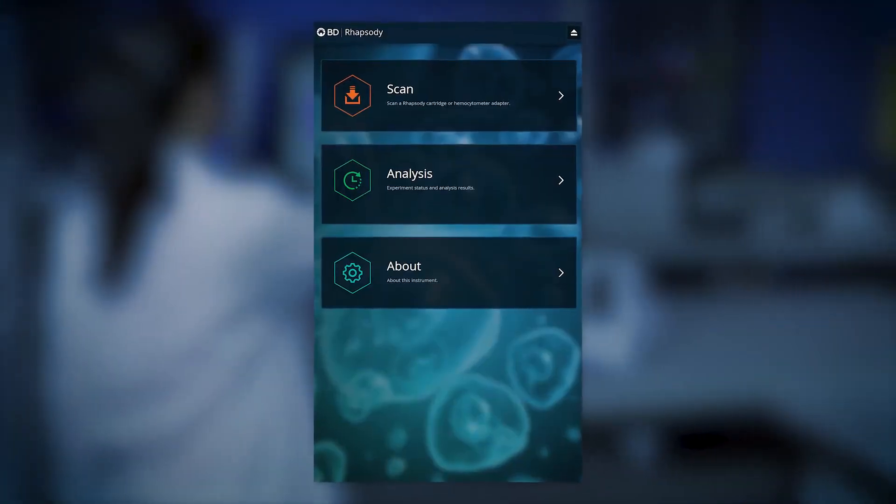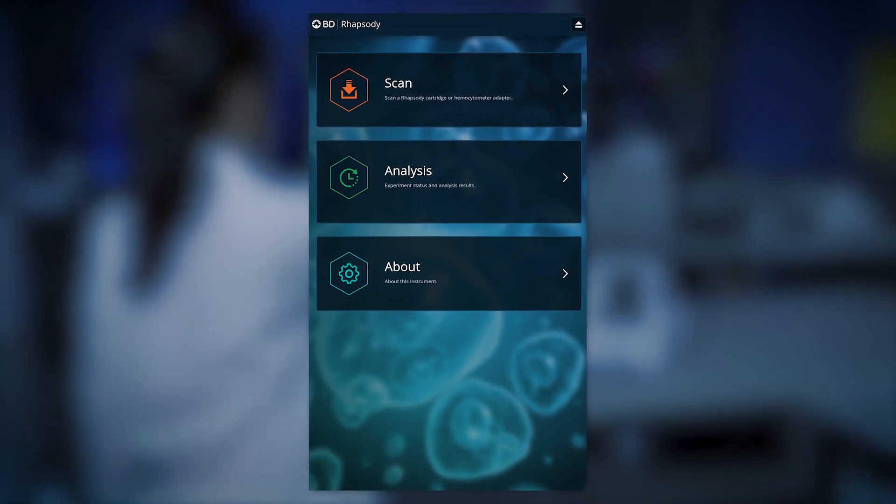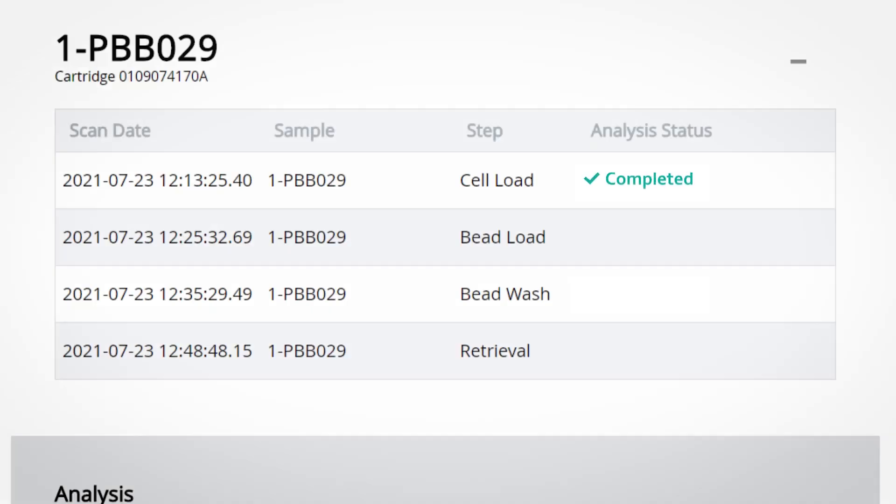The four main steps at which the BD-Rhapsody scanner captures quality metrics are cell loading, bead loading, after bead washing steps, and finally the bead retrieval step.